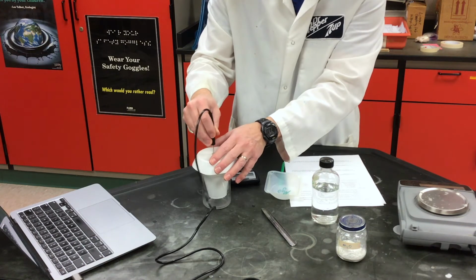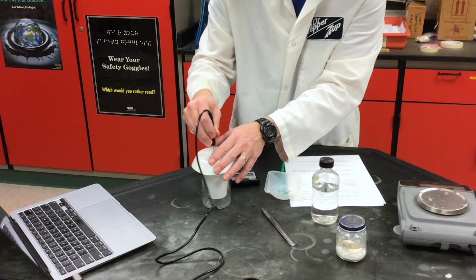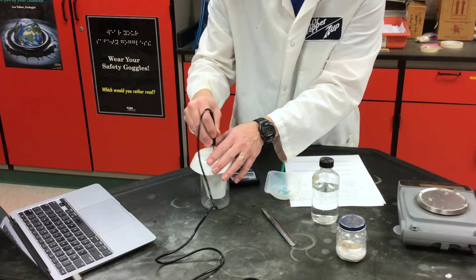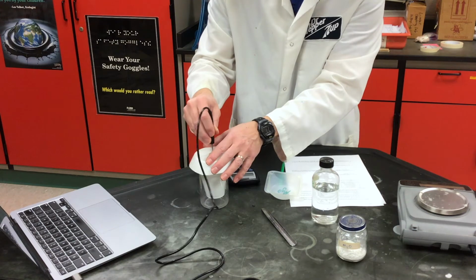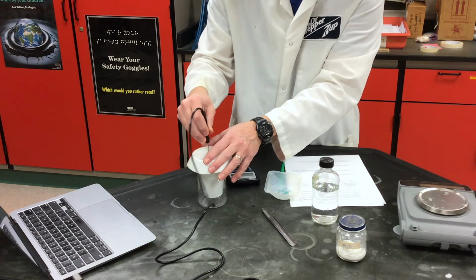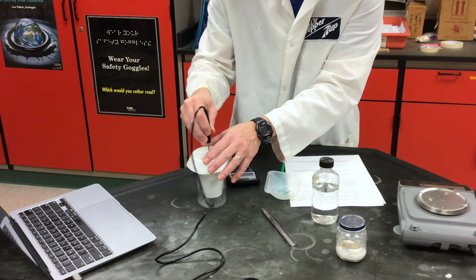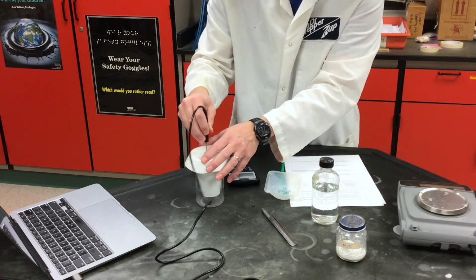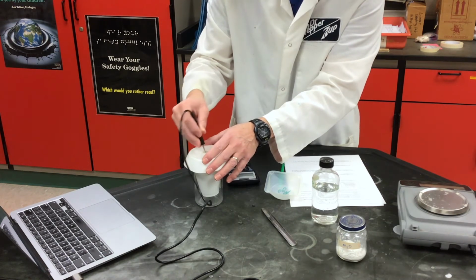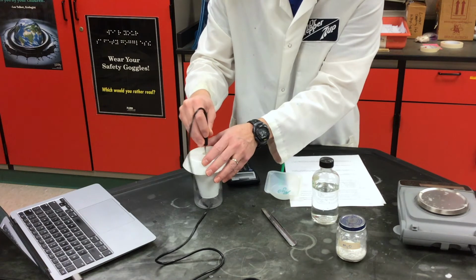What's happening right now? This reaction of magnesium oxide with hydrochloric acid is producing heat into the surroundings, right? So this reaction is actually an exothermic reaction. We'll get to that in a minute. Because of that, we're seeing the temperature of the surroundings go up. I'm at 21.7 right now, and I'm going to keep stirring, 21.8.